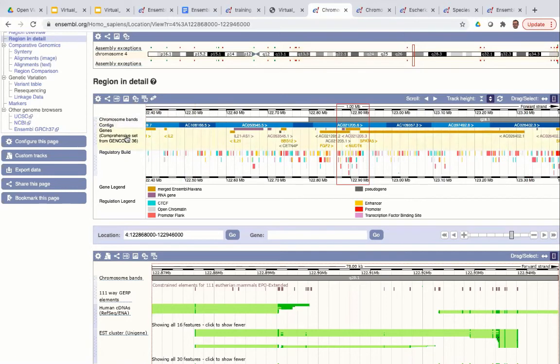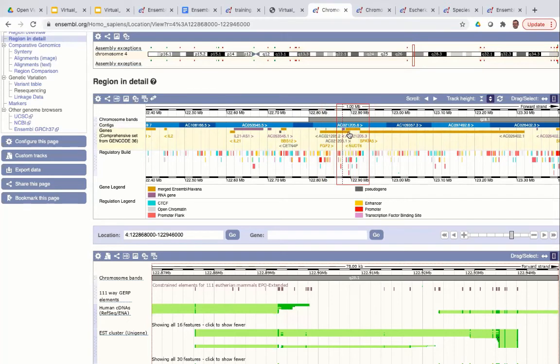In the tracks underneath you can see other data types, including the genes themselves represented as blocks. For example, the NUDT6 gene and the SPATA5 gene are visible with their names underneath. These genes and the data in the tracks are all aligned to the reference genome sequence — you can see that the FGF2 gene is upstream of the SPATA5 gene. At the bottom, in the Region in Detail itself, the genes are now represented as transcripts made up of exons and introns. There are two gene tracks: one for genes on the forward strand marked with a blue bar, and one for genes on the reverse strand marked with an orange-yellow bar.